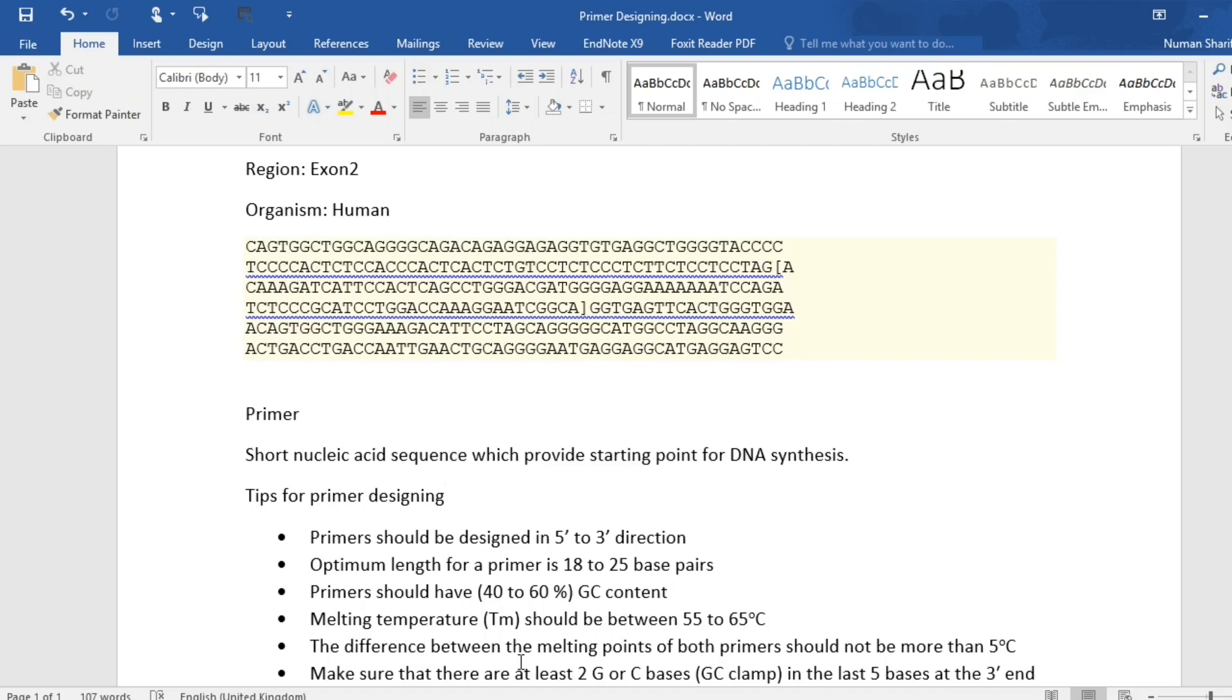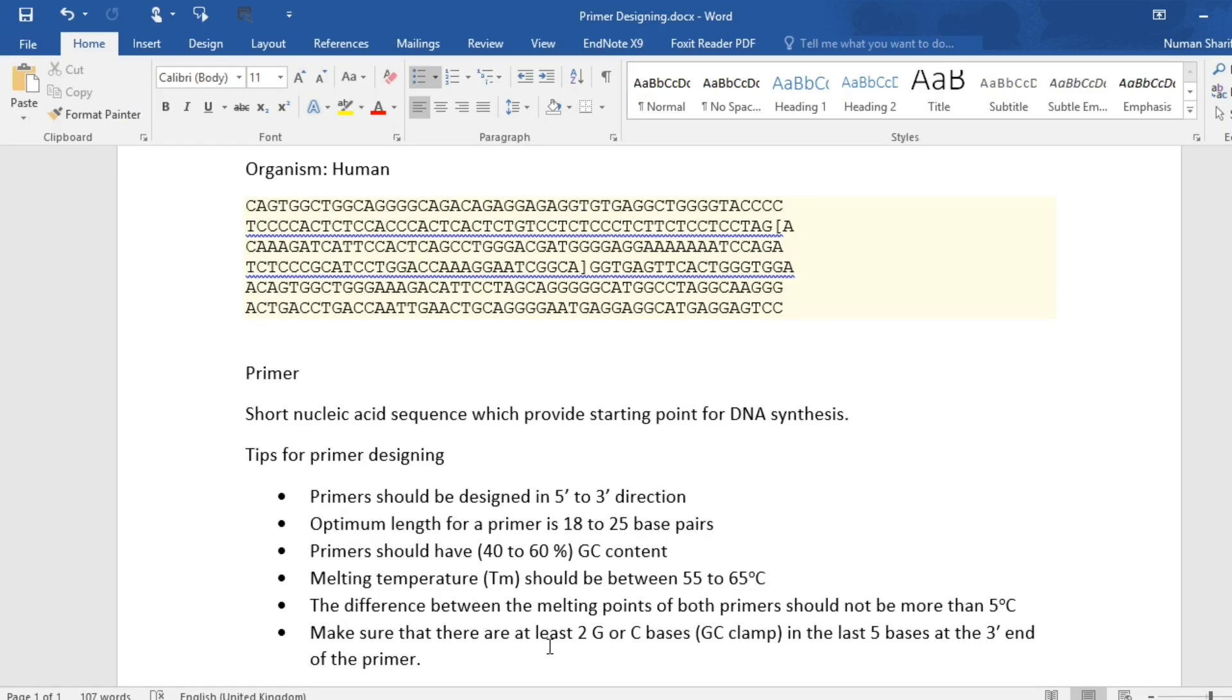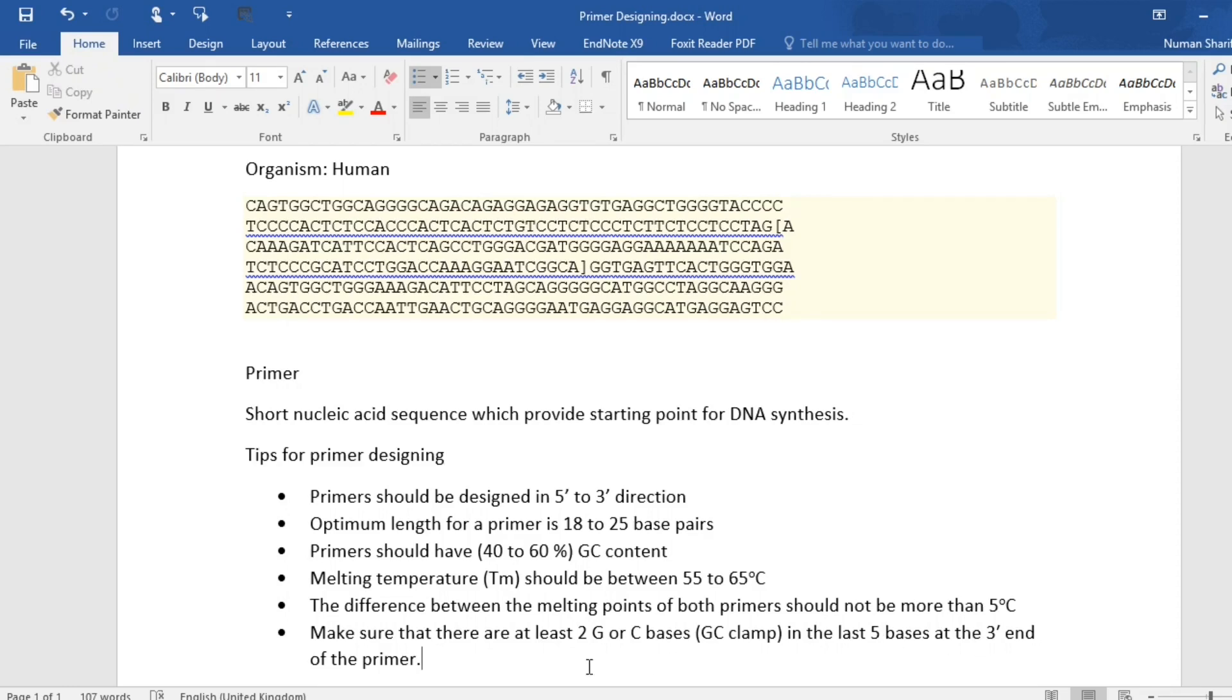The difference between the melting points of both primers should not be more than 5 degrees Celsius. And the last tip is make sure that there are at least 2 G or C bases, which are also known as GC clamp, in the last 5 bases at the 3 prime end of the primer. So these were some tips to design primers.